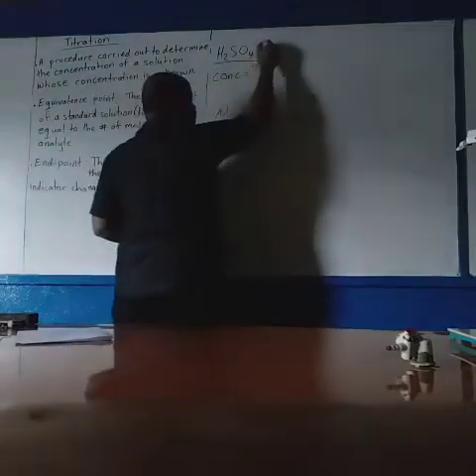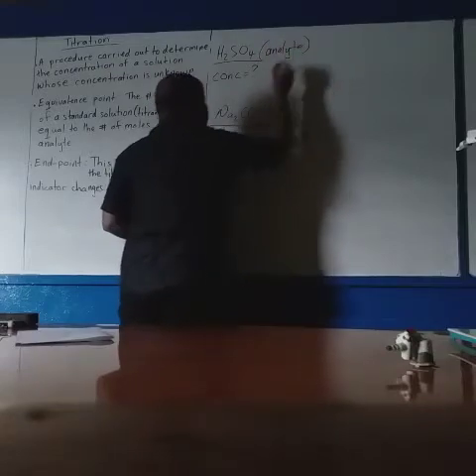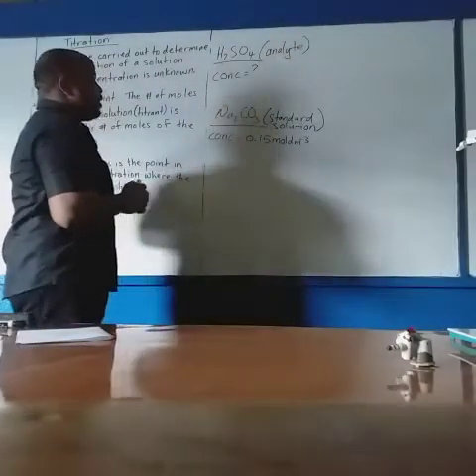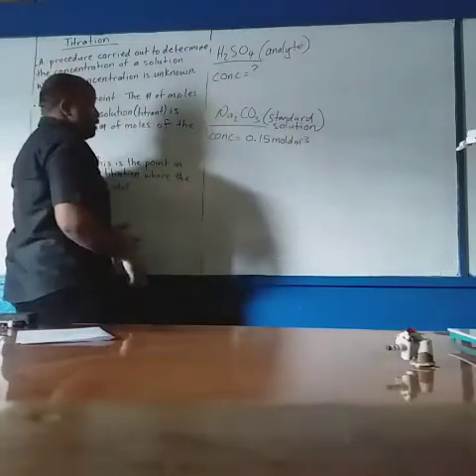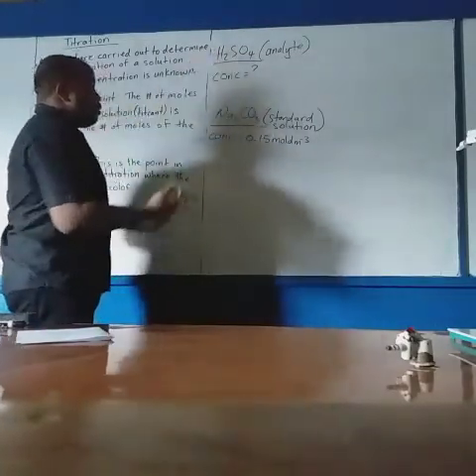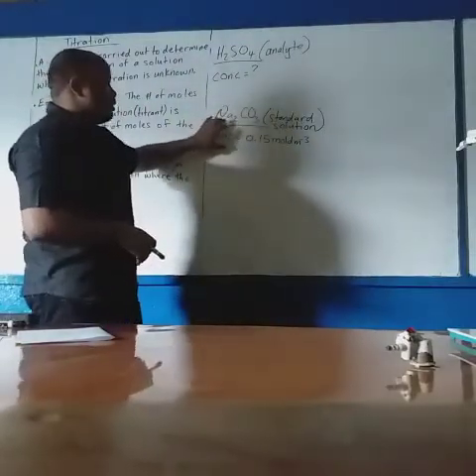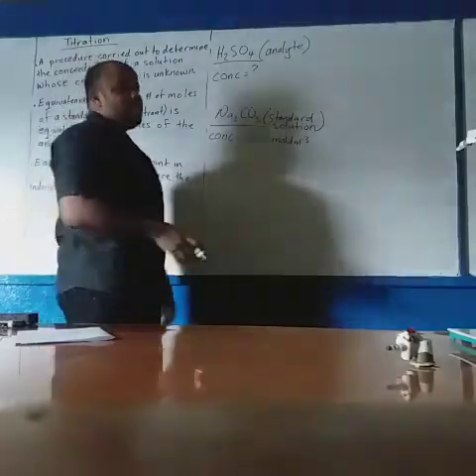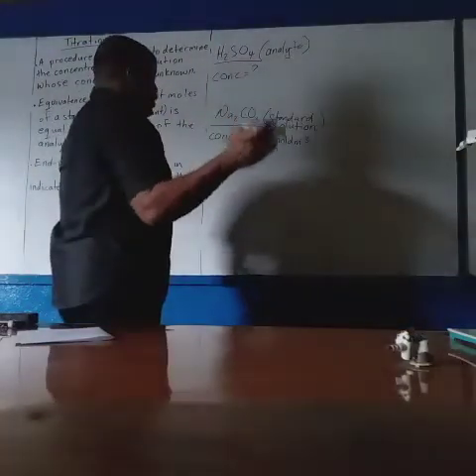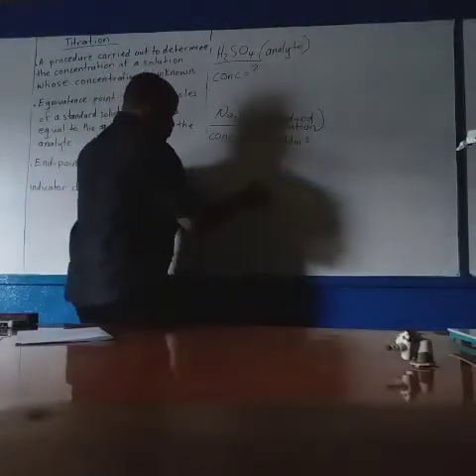This is my analyte, the substance undergoing analysis. So we have our standard solution and our analyte. How are we going to do the titration? Our standard solution is going in our burette. So let's say we fill the burette. How does the burette set up?